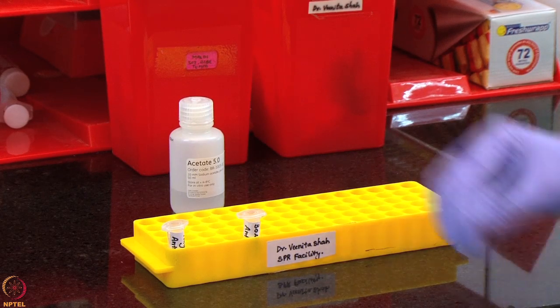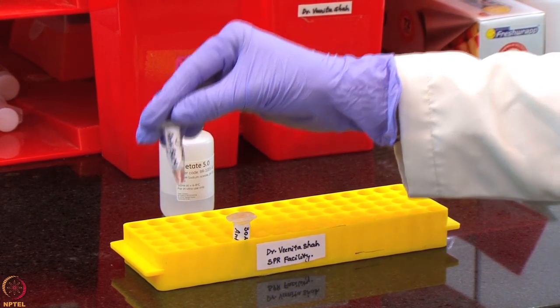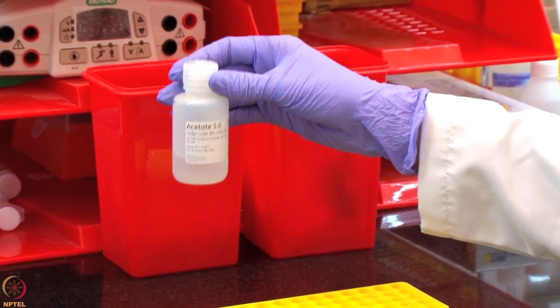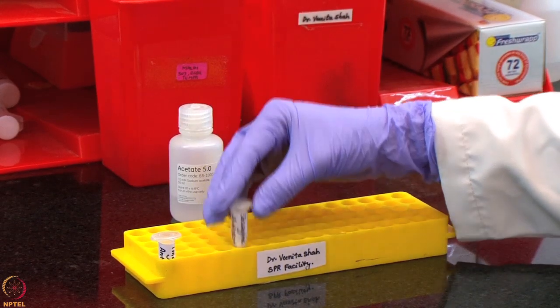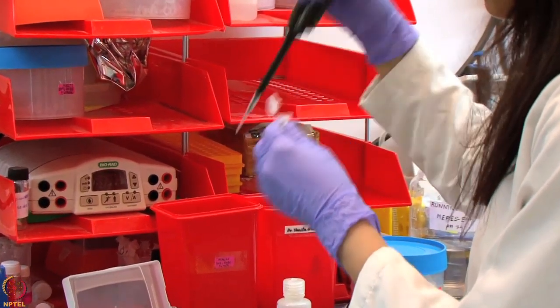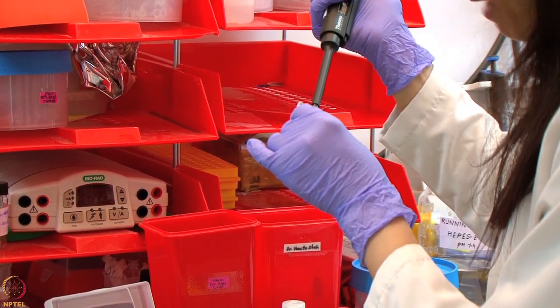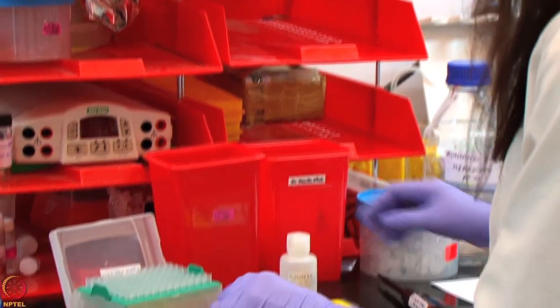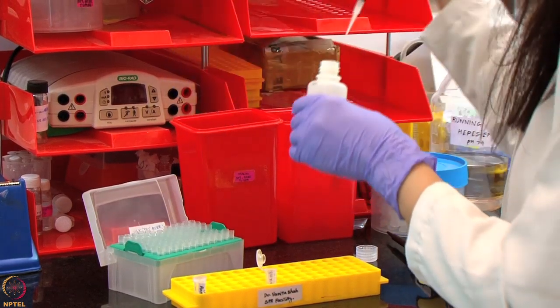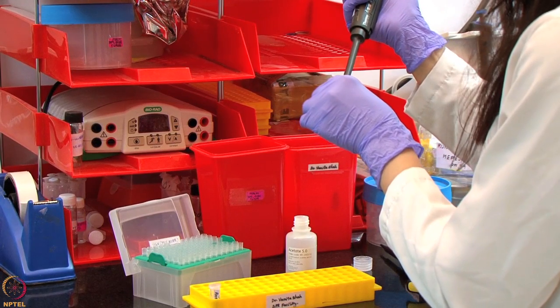We will first dilute the stock concentration of the antibody, which is 1 mg per ml of anti-beta-2 microglobulin, in 10 millimolar sodium acetate pH 5 to make a working antibody solution of 30 micrograms per ml. For this, we will take 6 microliter of the ligand stock and mix it with 194 microliter of sodium acetate pH 5. The choice of the correct immobilization buffer is an important parameter to consider, and the pH scouting feature of the system can help in choosing the correct pH of the immobilization buffer.